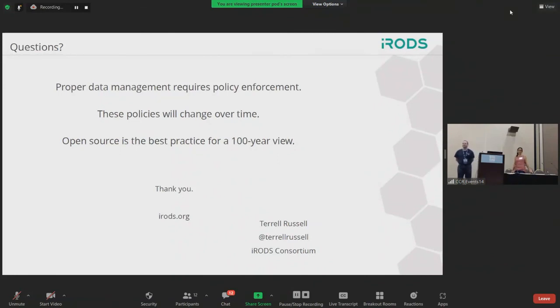Okay, you can hear me again? Okay, cool. Yeah, so really nuanced data management policy has been something that we've been really struggling with, because it's not just okay, this is your raw data, nobody's touched it in a year. It's more like, you just generated 40 different outputs from your neural network, and you want to compare them, and you're using them a lot for the next 2 days, but then maybe you don't touch them again for the next 6 months, but then you want to load them up again when you're writing up your publication. And so moving things back and forth to and from cold storage and doing this across labs has been a huge problem.